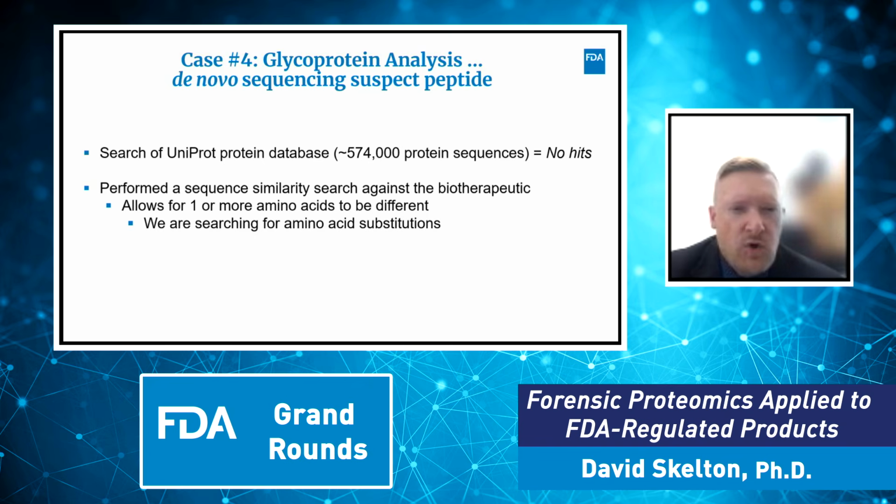So what we do then is say, okay, we know that no protein has this exact sequence in it, but instead we're going to perform a sequence similarity search. So we perform a search that says it may not be exact, but show us what protein has this sequence in it that most closely matches our suspect peptide.